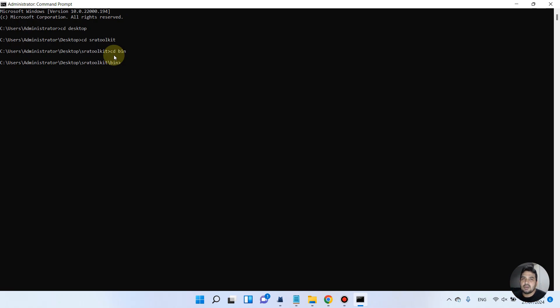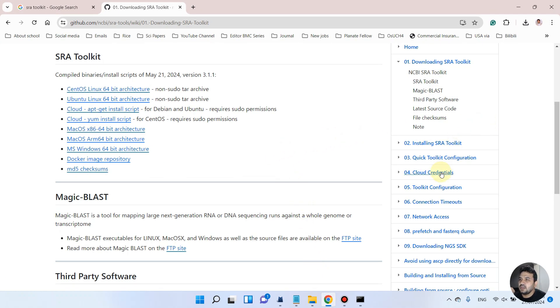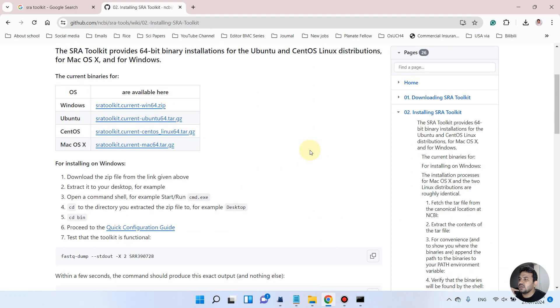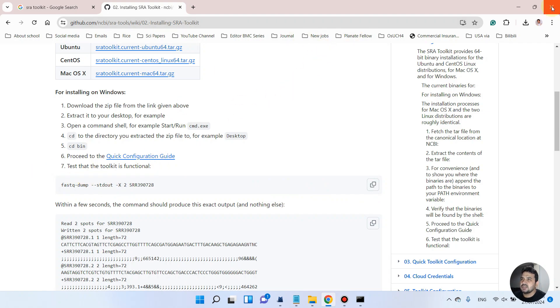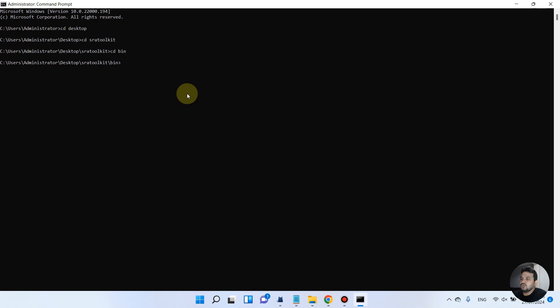We are now in the bin folder. There are two things to configure SRA Toolkit. Looking at the installation instructions, we need to run one command. We want to test our SRA Toolkit, so we can copy this test command, which uses fastq-dump.